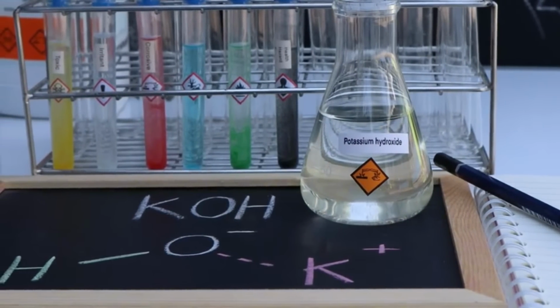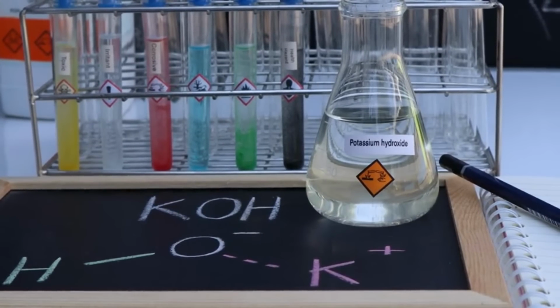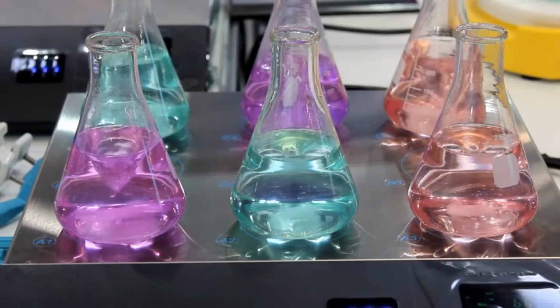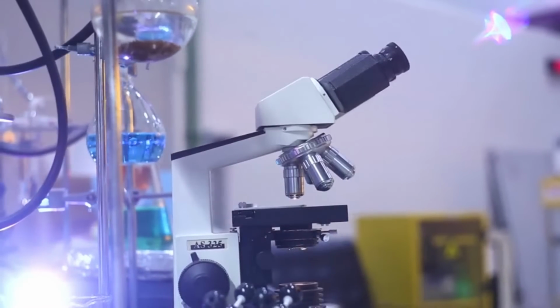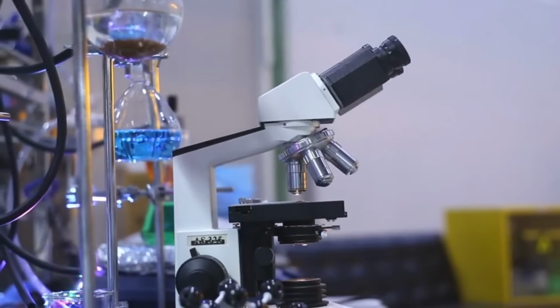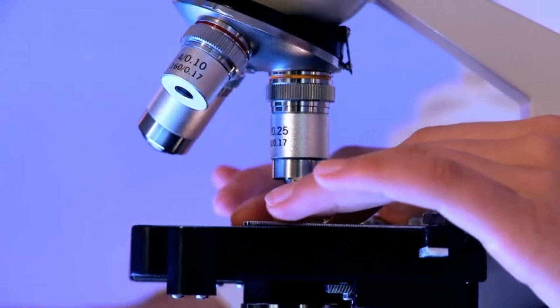Pipettes deliver precise sample or reagent volumes. Mechanical or electronic models in various fixed or variable sizes. Proper technique is important for accuracy. Tubes and vials. Primary containers for collecting, transporting, storing and analyzing samples. Different materials for various analyses. Glass, plastic, etc. Spectrophotometry measures how strongly a chemical species or complex absorbs light at a particular wavelength. Important tool for analyzing chromogens and colorimetric assays.